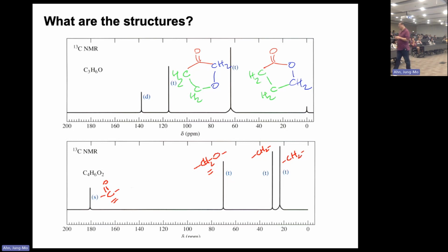Exactly. So you actually listened to me. Once you get to a conclusion, if let's say you believe this is the molecule that gives the spectrum, then what I want you to do is check your answer by trying to anticipate what the spectrum of this would be. The carbonyl will show in the same region, so I don't think that's wrong.